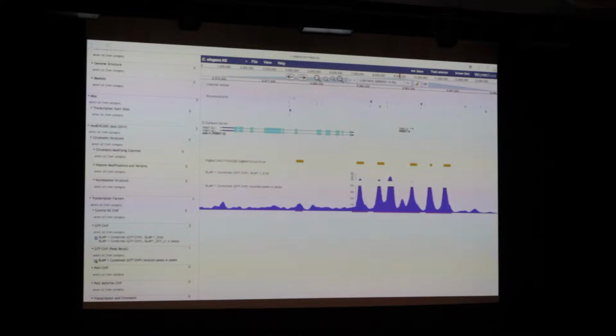But it's really attractive. And for the tracks that don't have peak calls, Chris Grove and I spent, it feels like months, trying to make these ones, like this track here, the embryonic one for BMLP1, filter a little better, to basically get the noise out, to adjust them so that it makes a little more sense. But anyway, I wanted to point that out too. So that's it for those, I think.